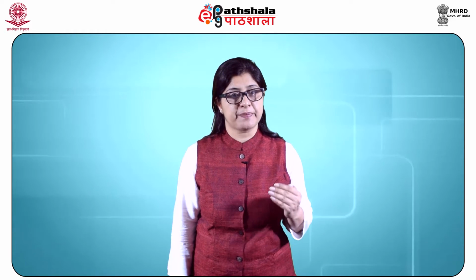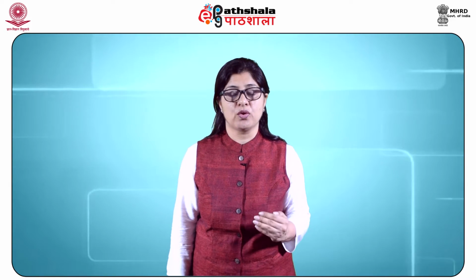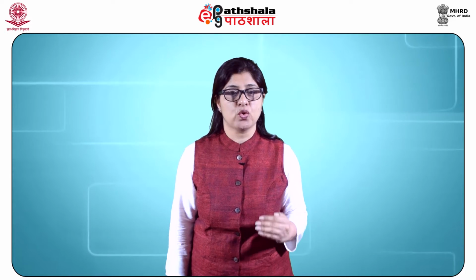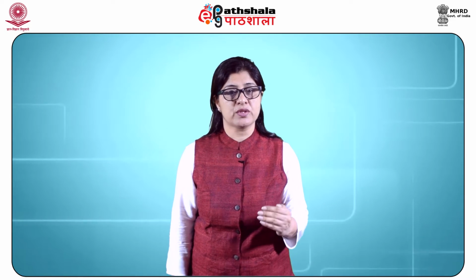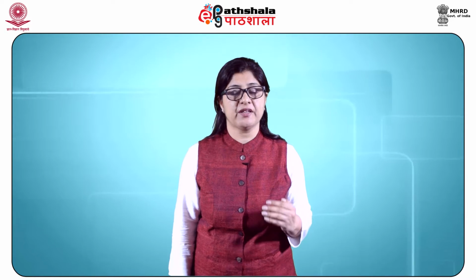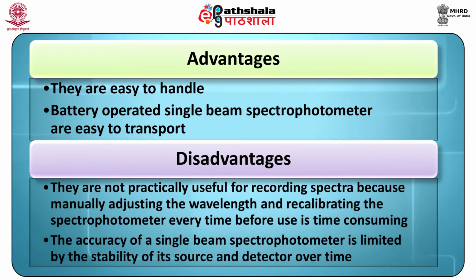Thermo Scientific Spectronic 20D Plus is an example of a single beam spectrophotometer. It has a range of 340 to 625 nanometers and a fixed effective bandwidth of 20 nanometers. The advantages of single beam spectrophotometers are that they are easy to handle. Battery operated single beam spectrophotometers are easy to transport.